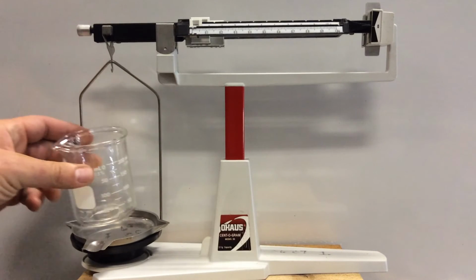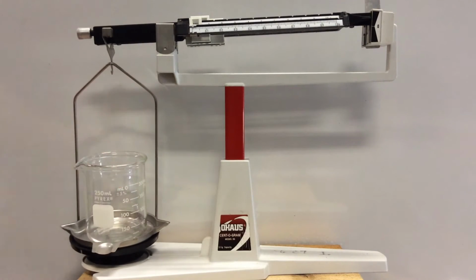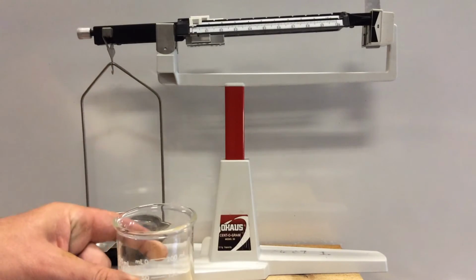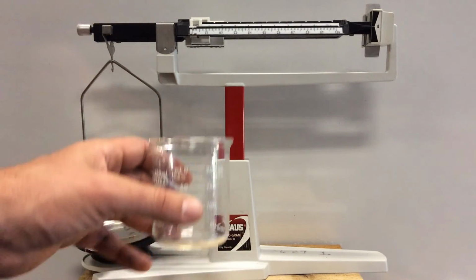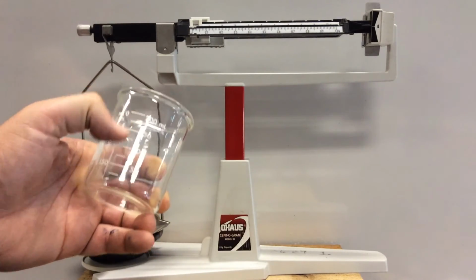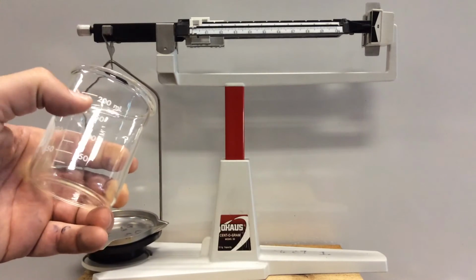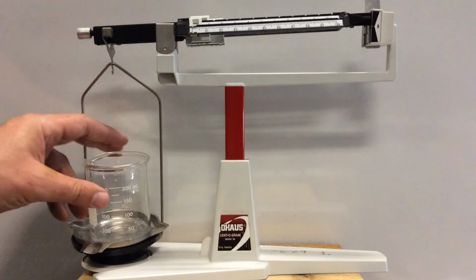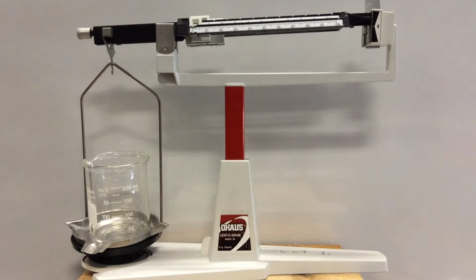So what I'm going to do is mass out the container, and knowing its mass, on your first column or the first line in your data table you have mass container. So we're going to use a 250 milliliter beaker, and something to notice about the beakers, they have little lines in them. These little lines are just for filling purposes. They're estimates. We never measure volume with a beaker. A beaker is a container, so these are not very precise markings. Anyway, so I'm going to measure out the container, and we can use that container for the rest of the lab, assuming it's dry and it's clean every time.